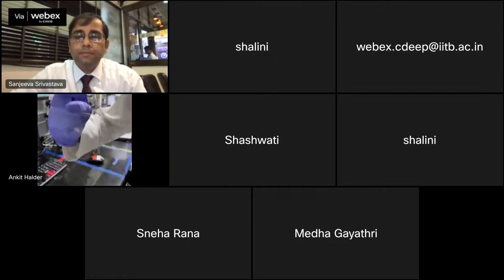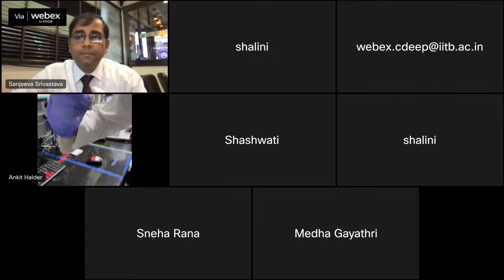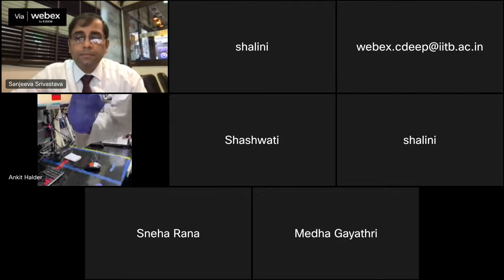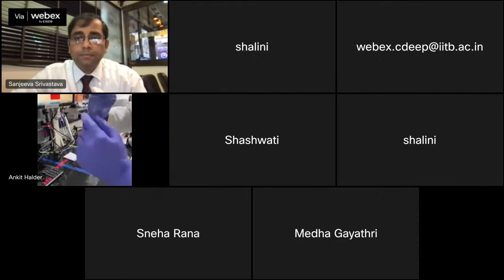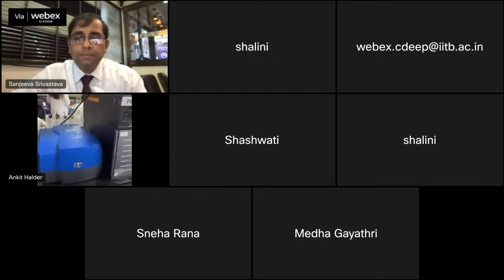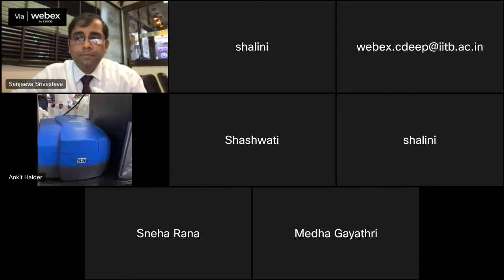All these slides are microscopic slides, so you cannot see anything with your human eye. So we want a very good instrument to extract the intensity of the proteins. For that, the next thing we need to show is the scanner. So this is the scanner. This is the GenePix 4000 scanner.